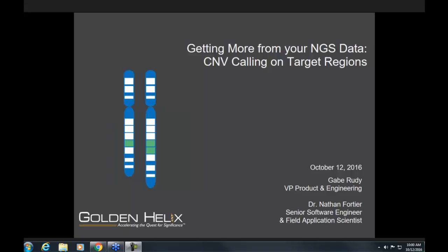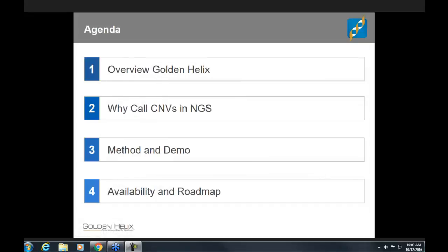All right, thank you, Cheryl. So I'm very excited today to be sharing with you the work we've been doing on creating a CNV calling algorithm that will be running in our VARSeq platform to call CNV events on targeted regions such as those in gene panels, etc. Before I get started too much, I also wanted to give you a little bit of a background about Golden Helix.